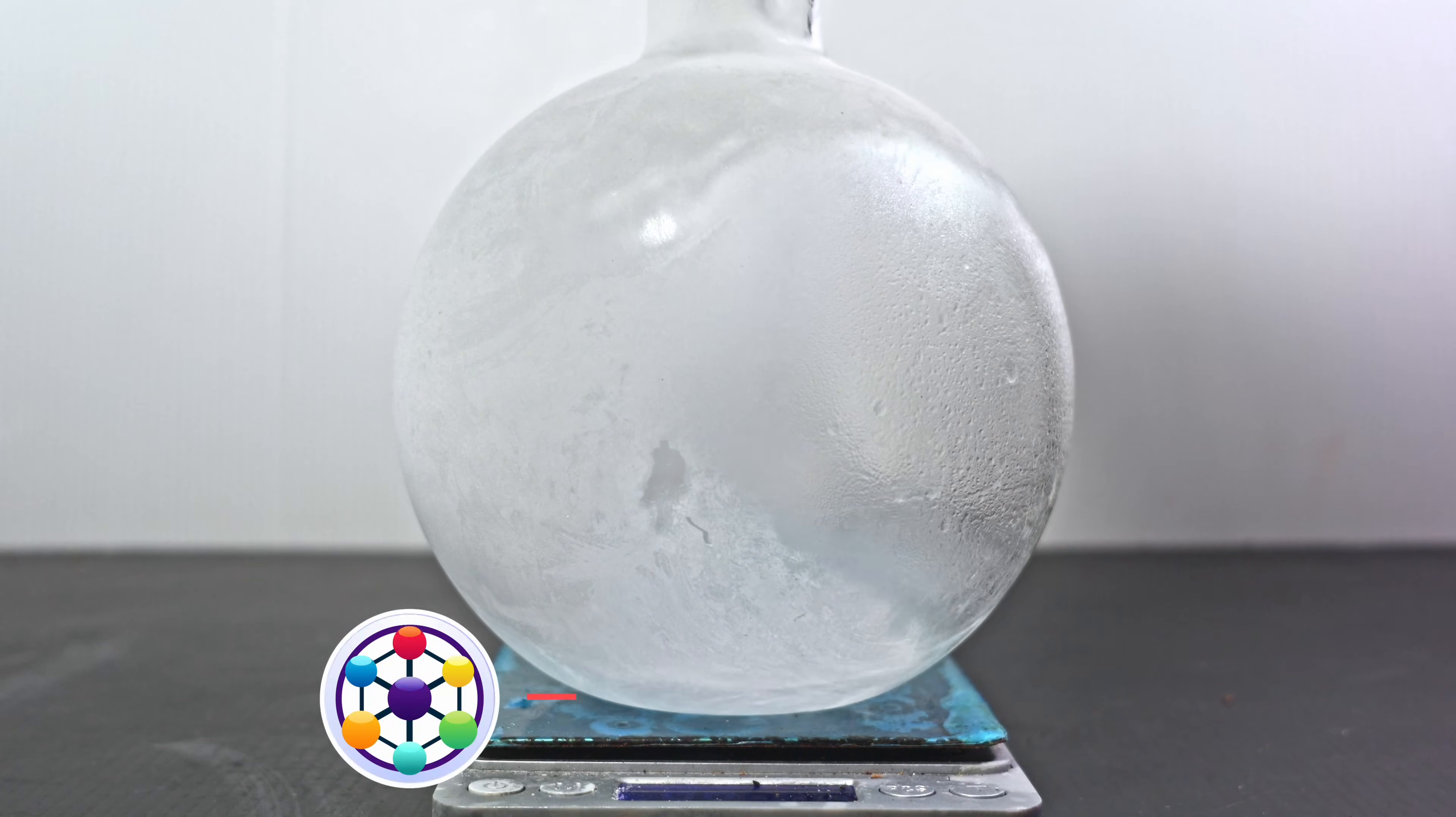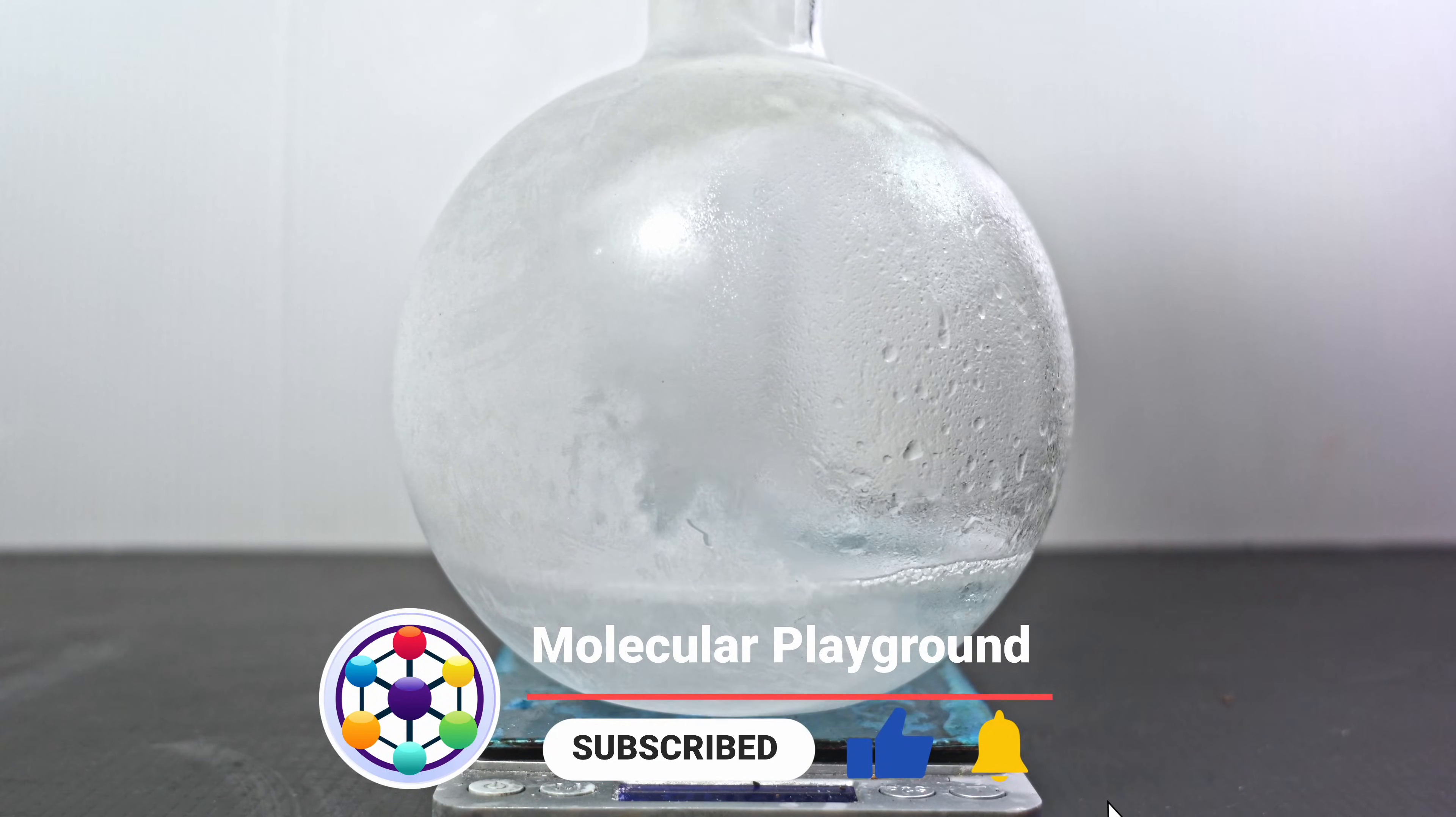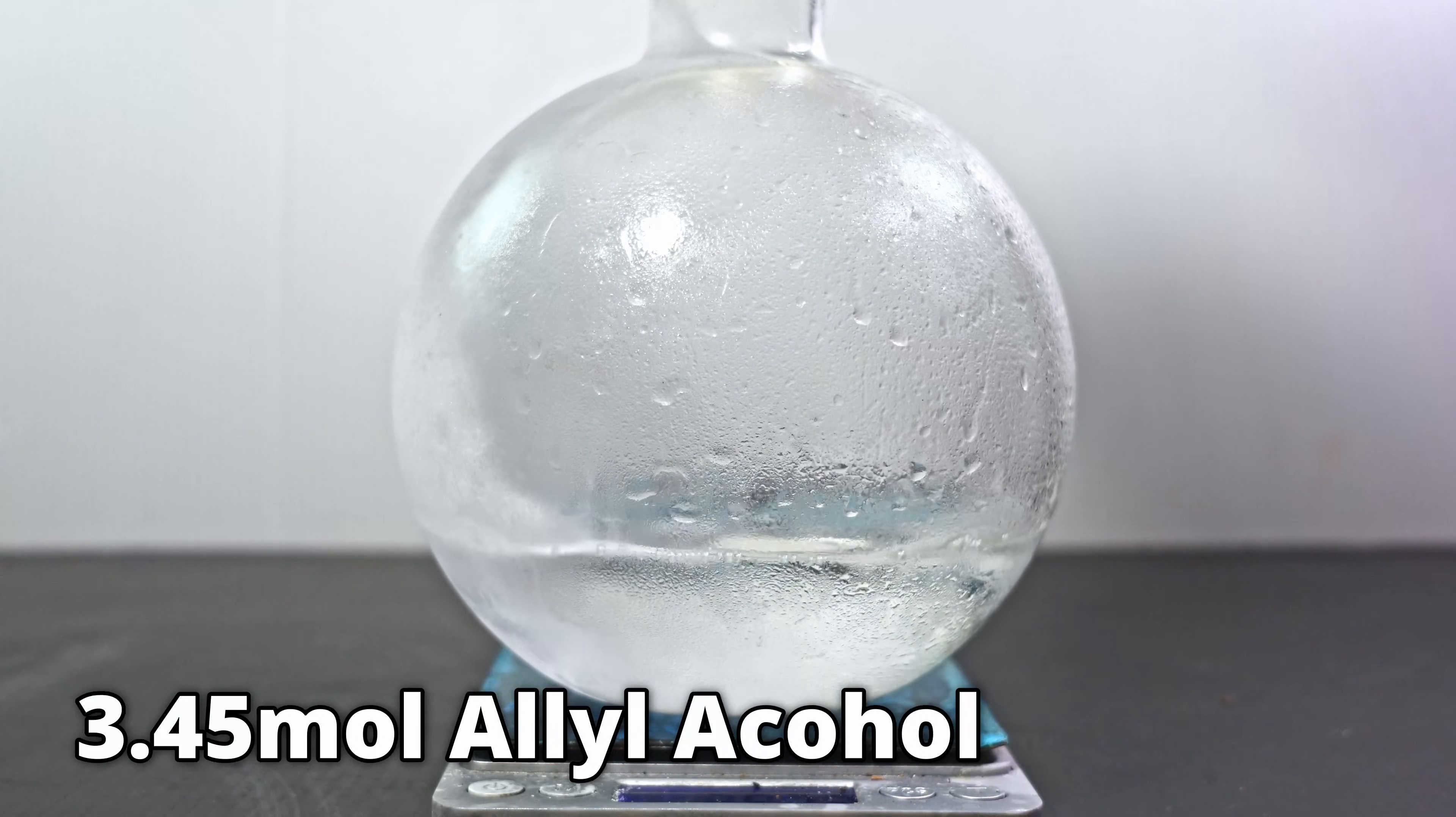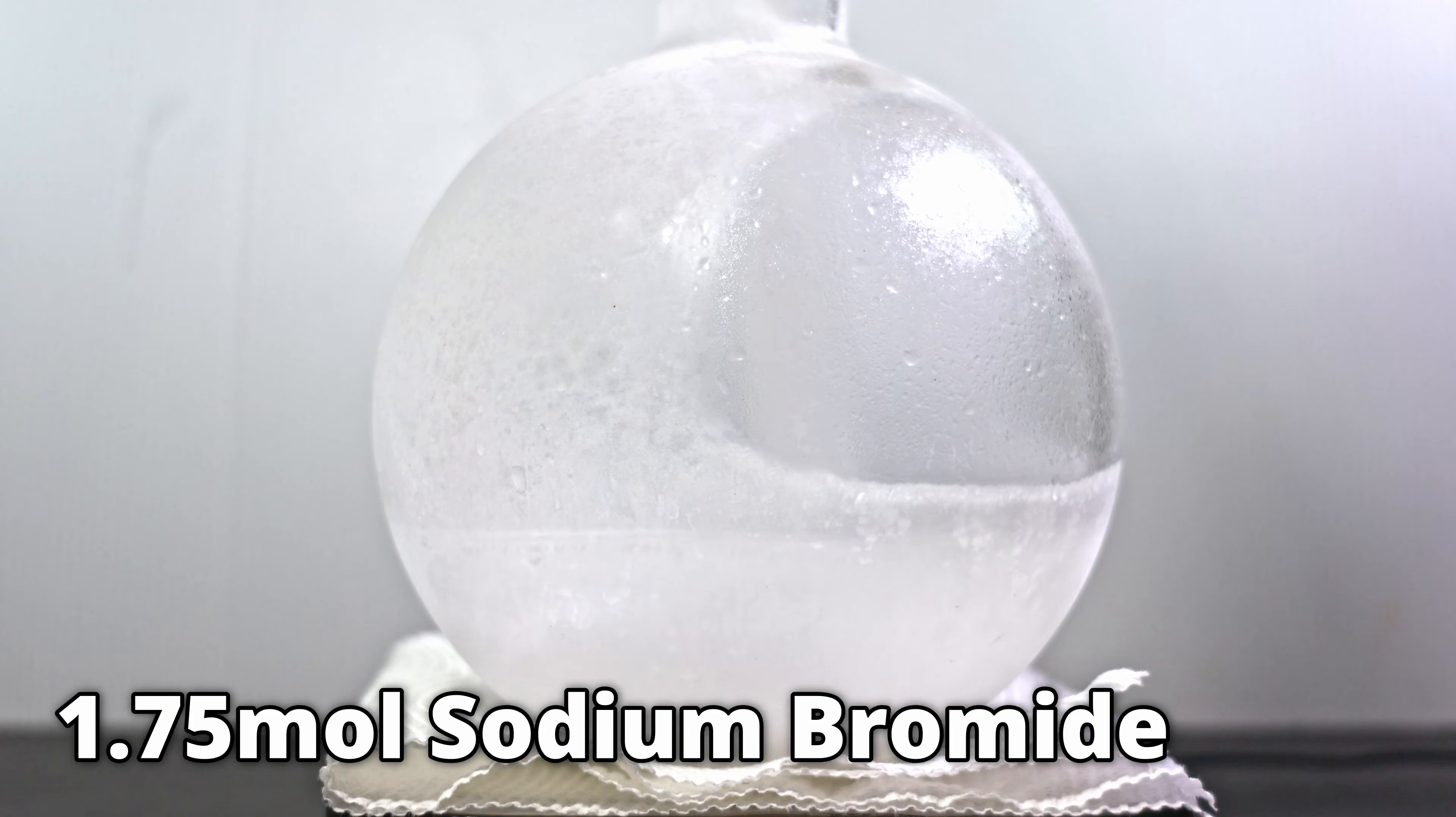In a freezing 1L boiling flask, I add the first half of my allyl alcohol solution, which is about 300ml of 70-something percent allyl alcohol. This contains around 200g of allyl alcohol, or 3.45 moles. While stirring, I add 180g of freezing sodium bromide. This is approximately 1.75 moles of sodium bromide.